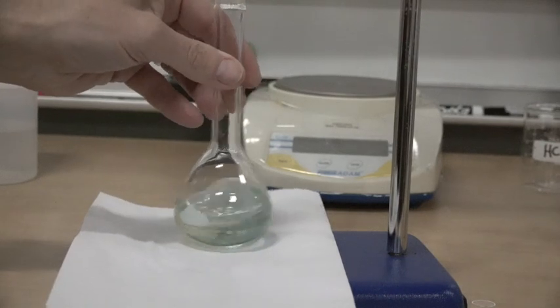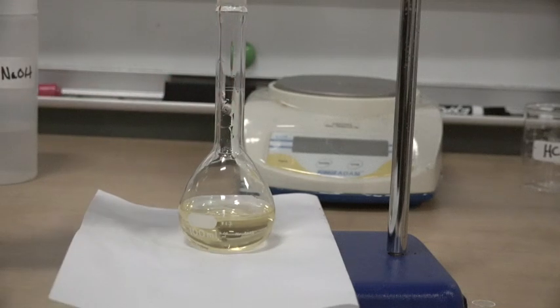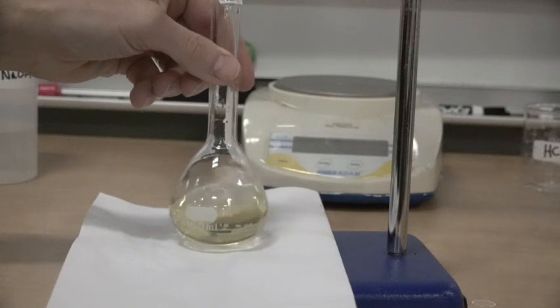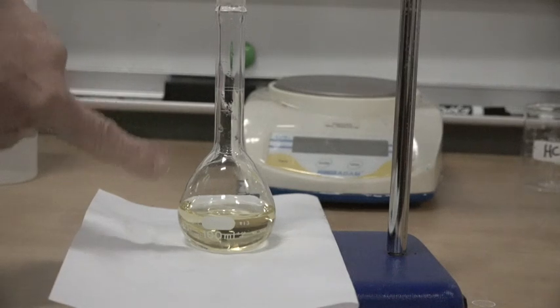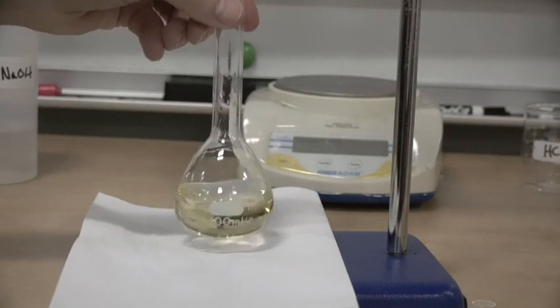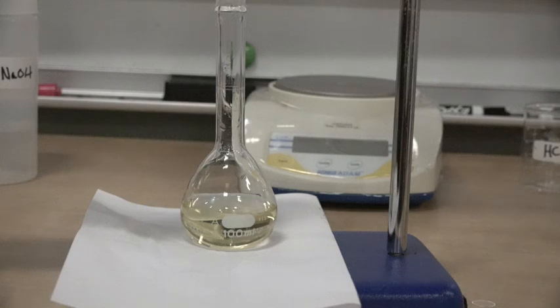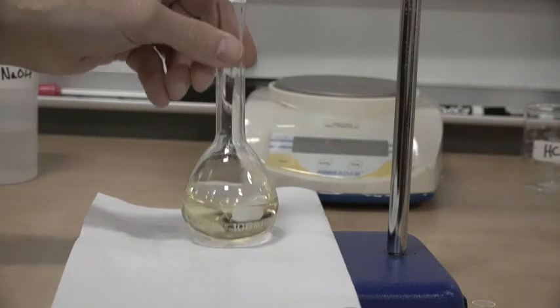And you can see, did you see the blue? Now we are very close. Every time we put some in, it's going to turn blue, and then it's going to go back. So what we know is that is very close to being neutral, so we're going to go kind of drop by drop. Right, those are those drops. Oh yeah, we're getting close.